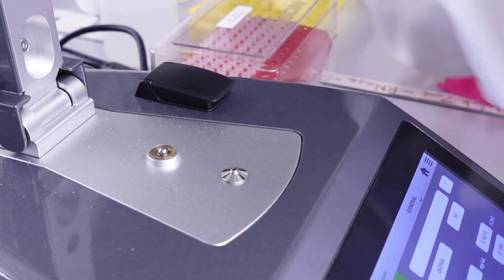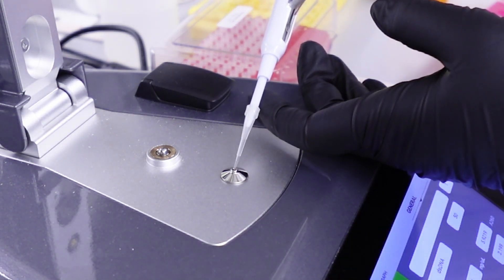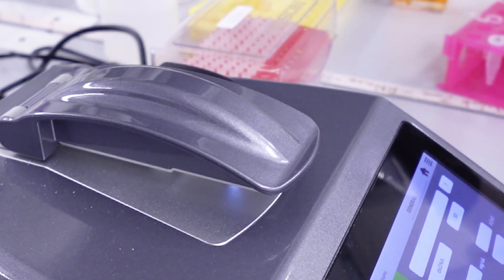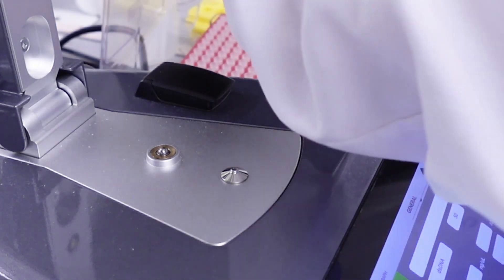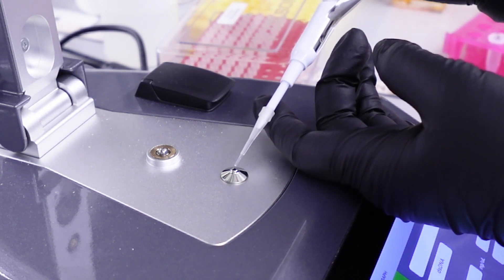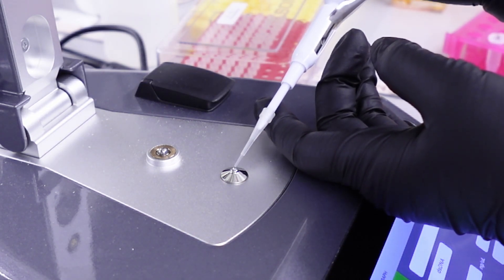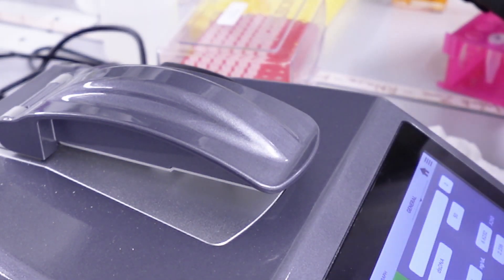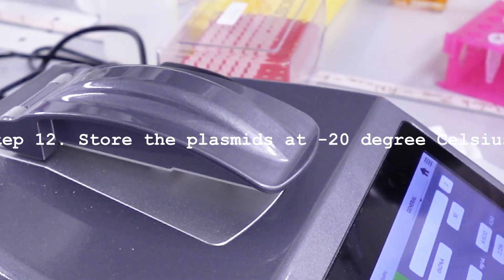So basically you can measure the absorbance at each wavelength, and that's what the curve gives you. And then you can also calculate ratios of absorbance at different wavelengths. What that does is it gives you a rough estimate of how pure your sample is, because different types of macromolecules will absorb light at different wavelengths. For example, DNA will absorb at 260 nanometers, whereas things like salts and proteins will absorb at 230 and 280 nanometers. By calculating the ratios and comparing them to scientific standard ranges for purity, you can determine if there's too much protein or too many salts contaminating your sample.